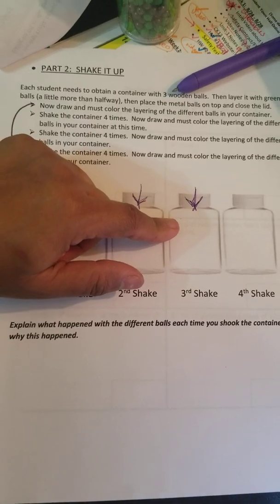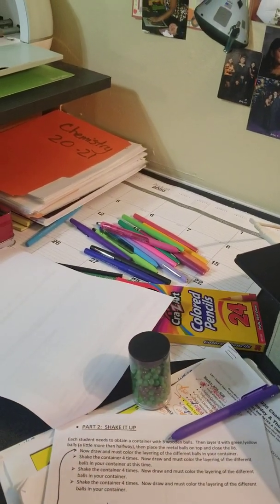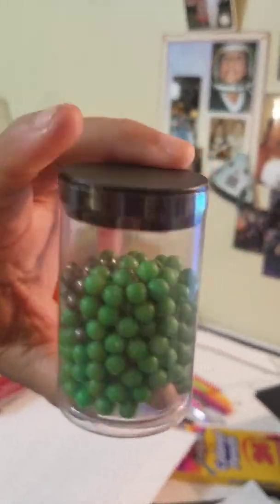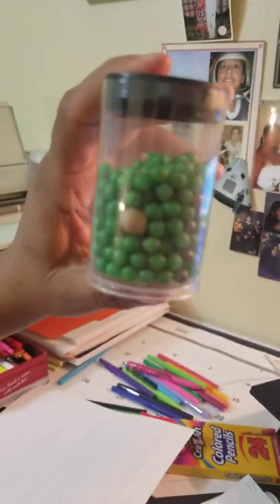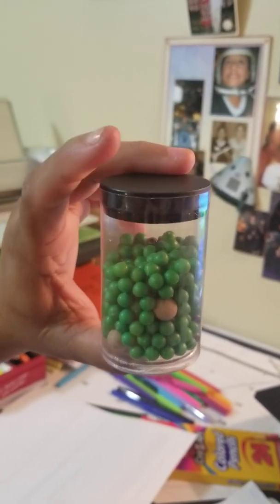You just saw what it looked like. And when you're ready, unpause it. But let me go ahead and do the last one. 4 more shakes. 1, 2, 3, 4. Don't color it just yet.